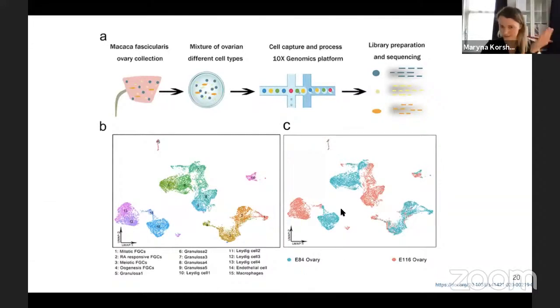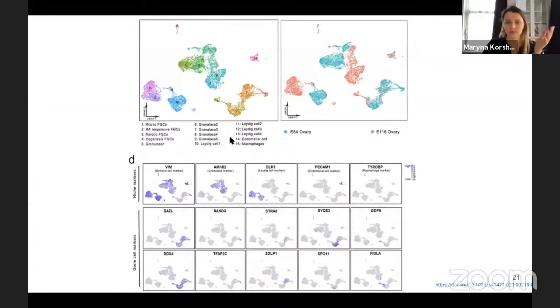You can do this, not just cell type plotting, but plotting other metadata, including your samples. I believe that it's very relevant. And the feature plot describing different cell type specific marker genes. And the heat map, so it's like the classic Seurat tutorial.